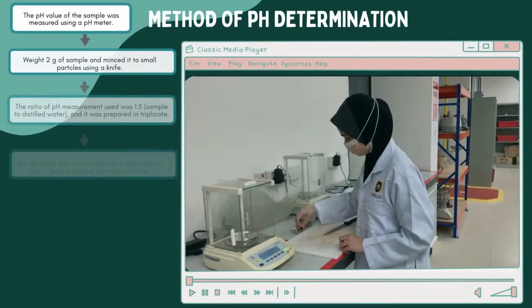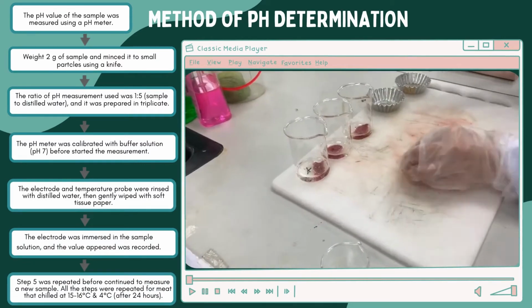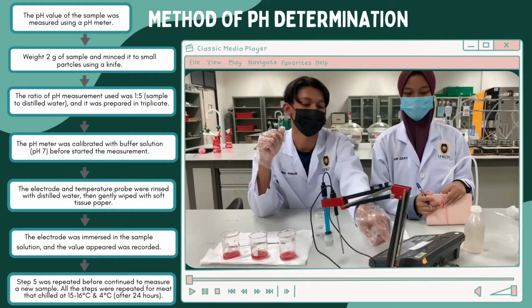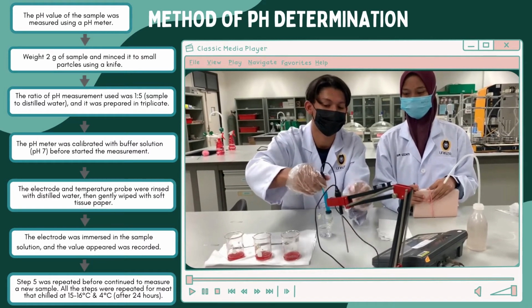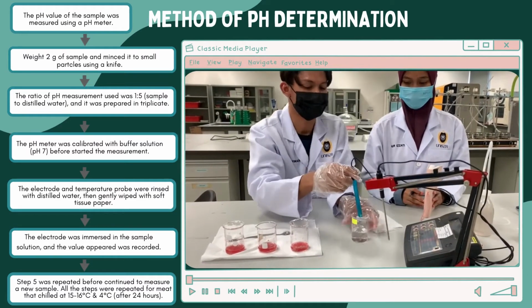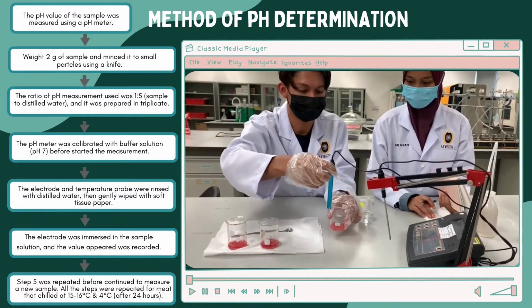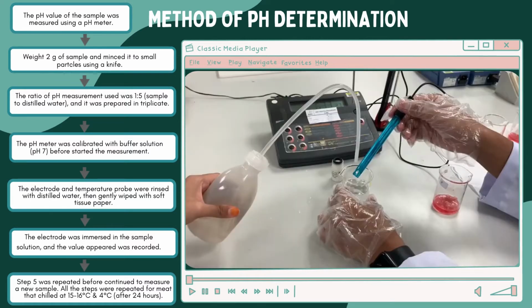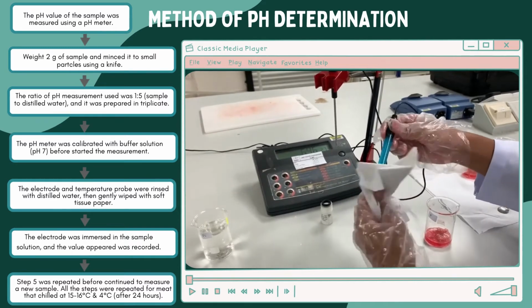Next is the method for pH determination. The pH value of the meat sample was determined by using a pH meter. The fresh meat was minced to small particles using a knife into a beaker with a ratio of 1 to 5 of sample to distilled water. Firstly, the pH meter was calibrated with buffer solution to ensure the readings are accurate. As the pH meter was ready, the electrode was rinsed with distilled water and gently wiped with soft tissue paper. Then, the electrode was immersed in the sample solution until the reading appeared. The electrode was continually rinsed and wiped before measuring the new sample solution.